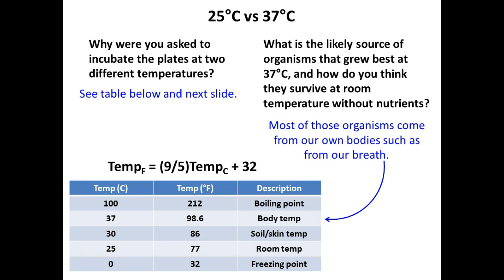And the most common offender is actually our breath. I actually have a really cool plate that I'll show you guys later on in the semester, and it has a contaminant on it. And it probably came from somebody breathing on their plate.